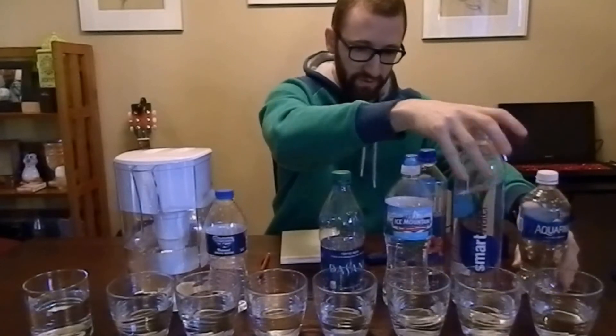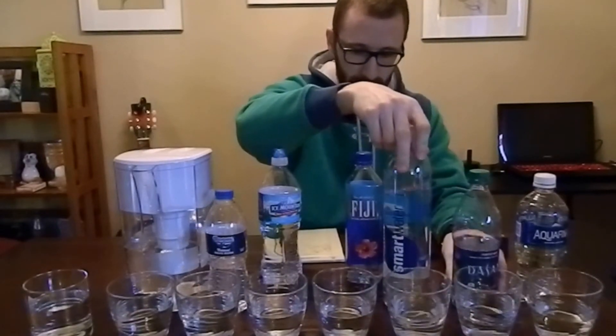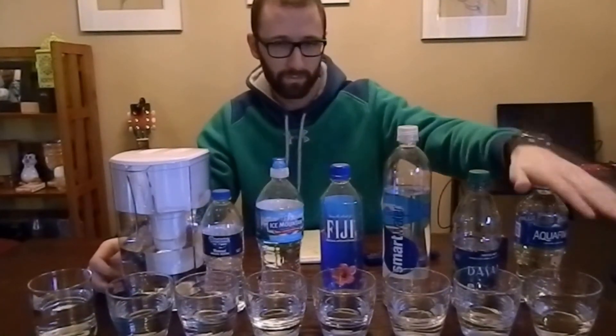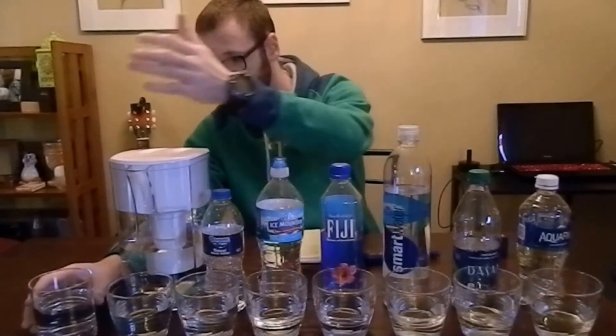I can rearrange these to give you a visual representation of what was the healthiest and what was not. Starting with Aquafina on this end and ending with tap water on this end, we're going from the purest, cleanest water — Aquafina — all the way down to 400 ppm tap water in my case. That's going to vary for everyone; you might have well water, and city water varies from city to city depending on the different chemicals they're adding.